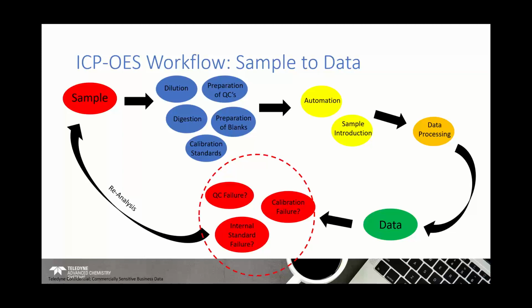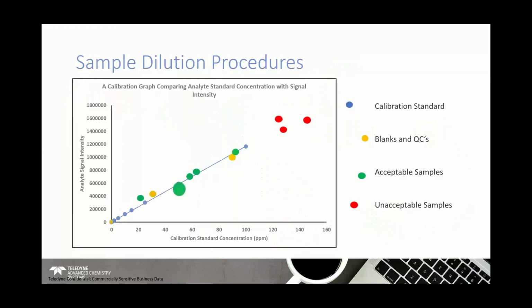If you've manually prepared everything, then again, you're talking about manually re-preparing everything. That might be the entire batch. It might be a small number of samples, but it's never really a small number of samples, because to reanalyze samples, you also need to re-prepare your calibration standards, blanks, QCs, etc. So the first situation I just wanted to suggest was this one.